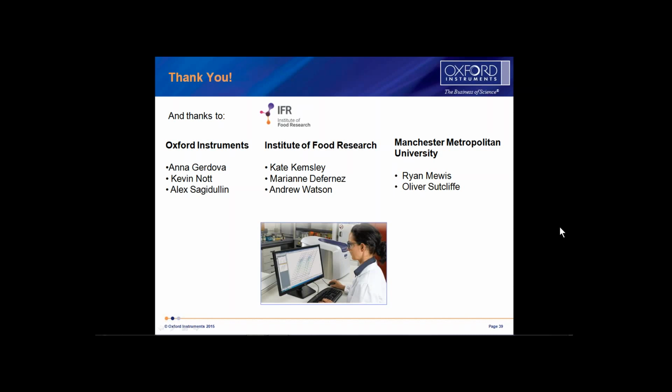We'll take one more quick one. Can we resolve more than 2 compounds in a 2D experiment? I haven't tried. The first test was to mix the 2 because they were very close together. In theory, for a 2D, we should be able to separate them out. To use the 1D experiment and extract certain information, you're really looking to have at least one peak that is well isolated from the others, so you can excite that selectively.